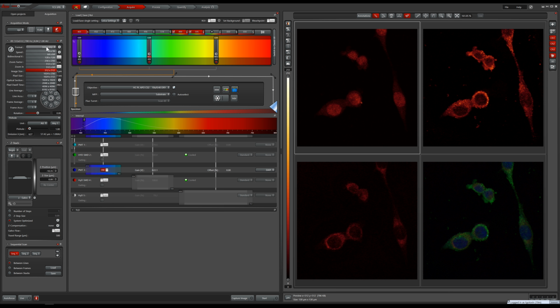After selecting your channels, the system is now able to calculate the optimal pixel size for your conditions. Click the optimization icon and pay attention to the changes this will apply to your pixel size. Leica will also suggest a particular format, but you can still choose your own. After bringing back the format to your desired dimensions, only make sure to adjust the pixel size back to the number that you have gotten after pressing the optimization icon by adjusting the zoom factor.